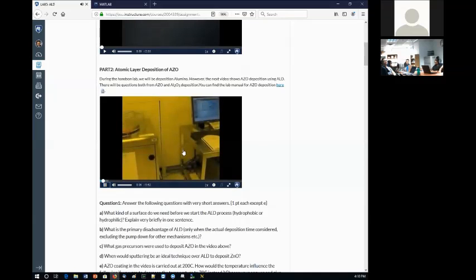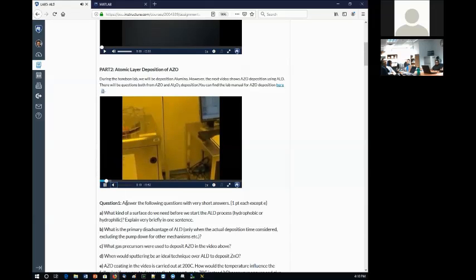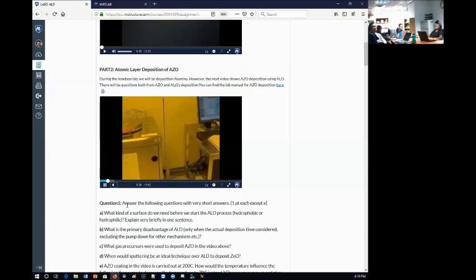Can you hear the voice of the video? Yeah. So this is the tool, and believe it or not, this tool costs quite a bit. These aluminum ALDs are really pricey tools.